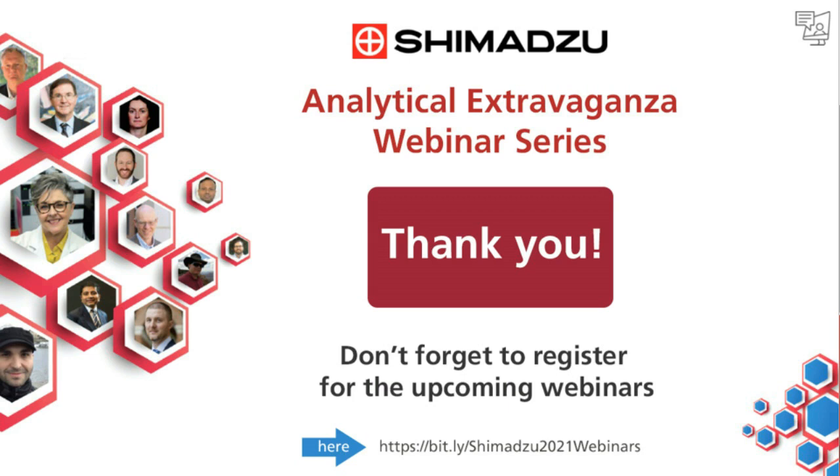Another question, and this is one of my favorite detectors: somebody said they would be curious if they could use a sniffer port to distinguish the chiral compounds. You could separate them if you use even multidimensional GC with chiral, probably you can completely separate. Even if you use chiral GC-MS with an olfactory port, you can separate enantiomers, right? But the retention time difference is so short, you might miss it. If you use multidimensional GC chiral, you will be able to smell both isomers and figure out what is causing the smell in the oil or any food. Yes, of course. Usually the separation of the enantiomers is not that much, so it could be just a second or two. So you'd have to have a very quick nose.